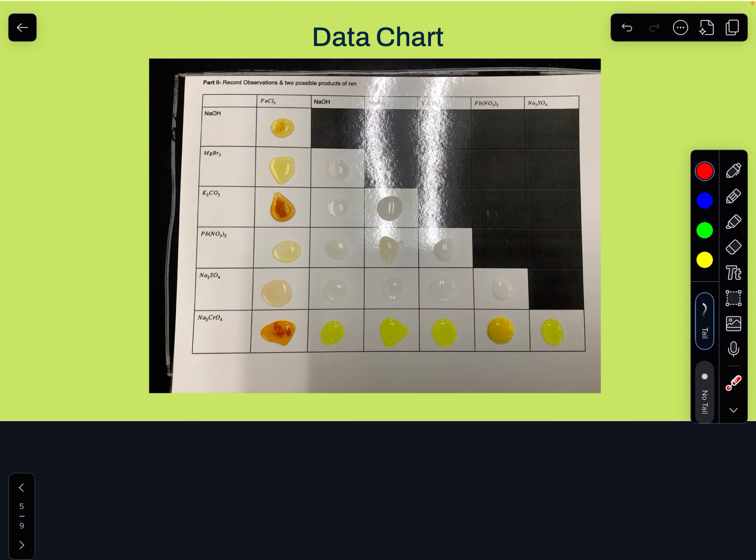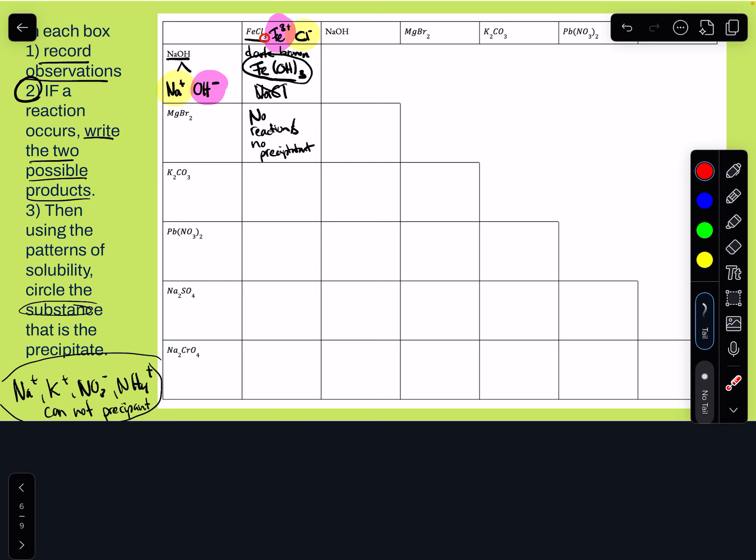Take your observations and then continue to fill in your data chart, once again where you identify the precipitant made and the ones that had a precipitant.